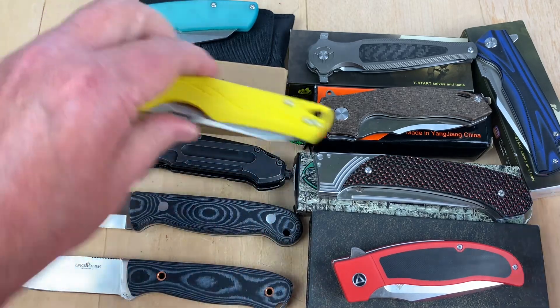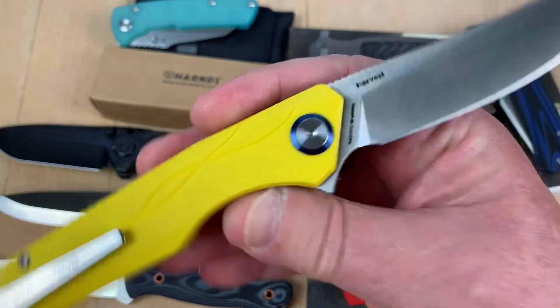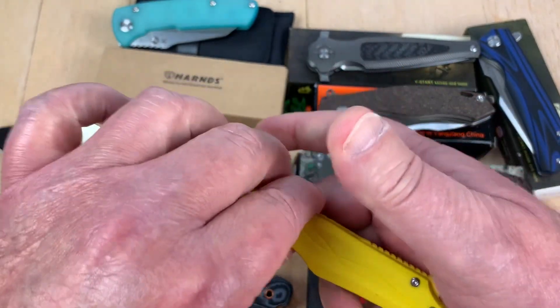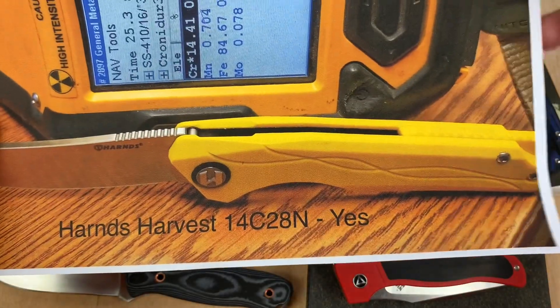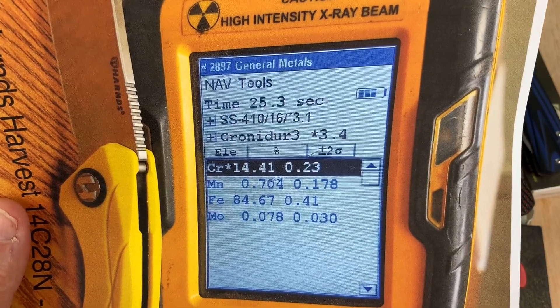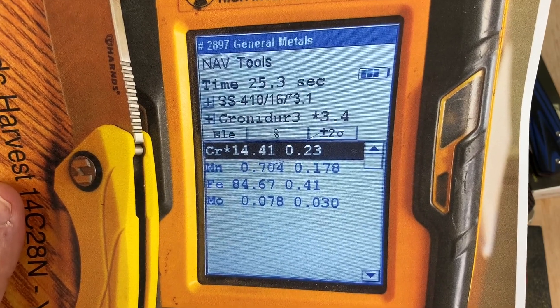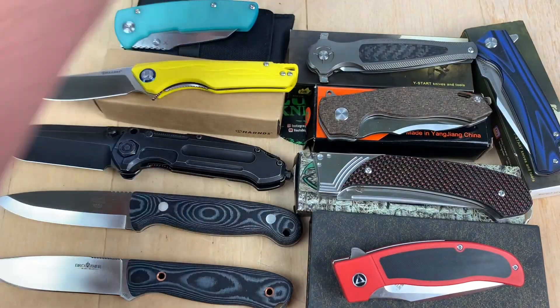We've got the Harnds Harvest — it looks like the wheat is golden and ready to be harvested. It claims 14C28N Sandvik steel. I like that harvest design — it's a pretty cool little knife. And yes, there it is: about 14.4% chromium, plus molybdenum, manganese, et cetera. Yes, it is confirmed 14C28N.